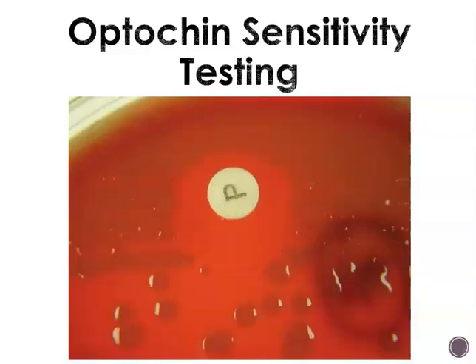It has to incubate overnight, about 18 to 24 hours. You come back and you're looking for that zone of inhibition, or zone of no growth. Remember, I mentioned that for some tests, any zone of no growth is considered a positive result. For some tests, you have to measure that zone. The P-disc is one of those tests where you have to measure the zone. We're looking for a zone that is 16 millimeters or larger. That's going to be our positive result.